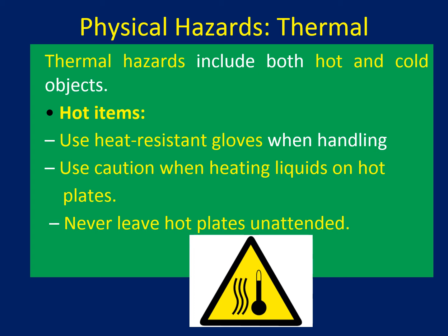That means if you are planning to do some research using a hot plate at a higher temperature like 70, 80 or 90, have some plan, right? Don't keep it switched on for 24 hours, because we are going to close the lab around 4:35 and then nobody will be in here, and in case of emergency, who knows, right?